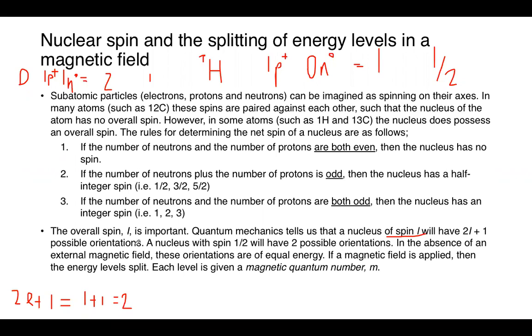In the absence of an external magnetic field, these orientations are of equal energy. If a magnetic field is applied, then the energy levels split.